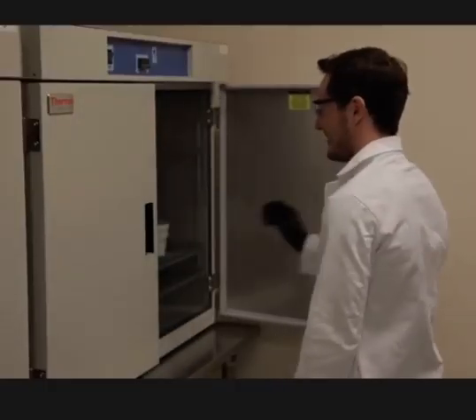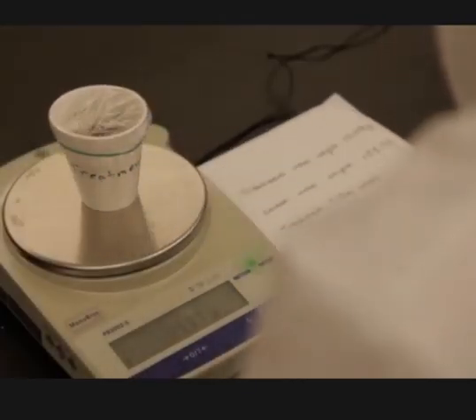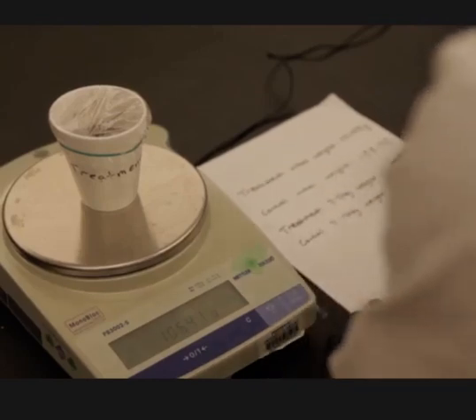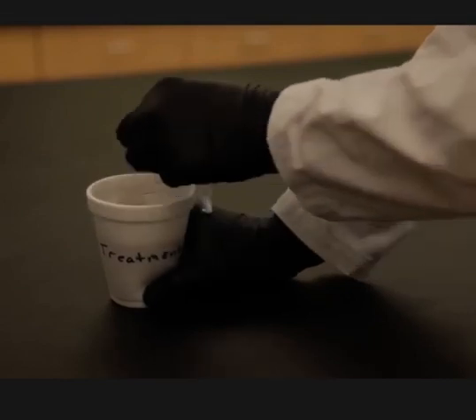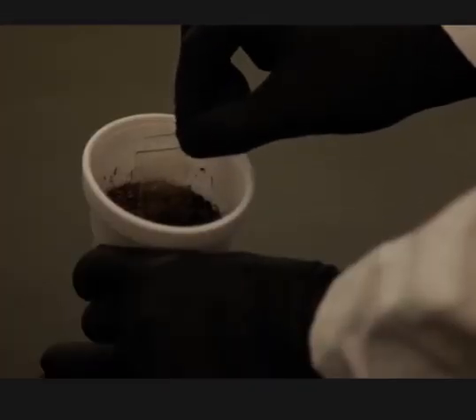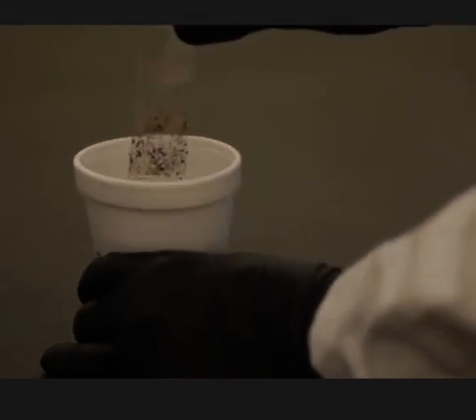After the 7-day incubation, calculate the soil moisture content by weighing the soil cups. Determine if weight has been lost due to water evaporation and replace the water if needed. Remove the plastic wrap from the container and remove 2 slides from the soil by pressing each slide to an inclined position and withdrawing so that the upper face of the slide is undisturbed.